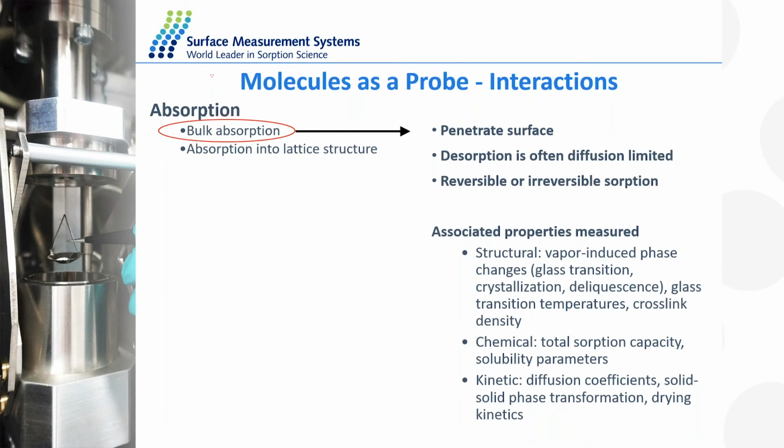And because it is a diffusion limited interaction, we can also understand the kinetics. So diffusion coefficients and looking at maybe drying kinetics.